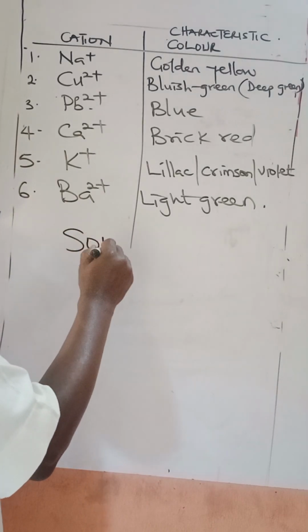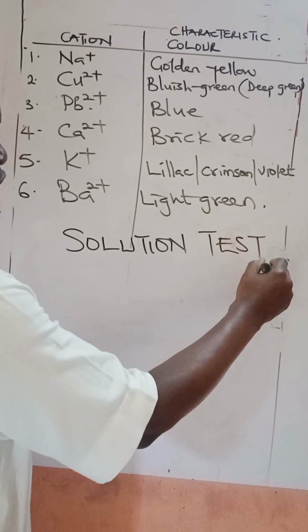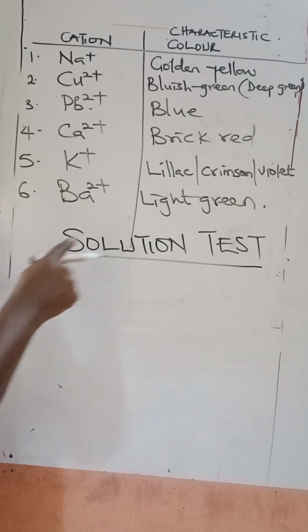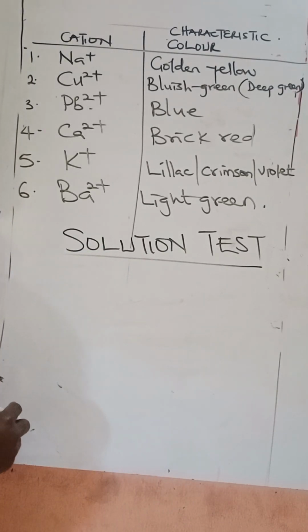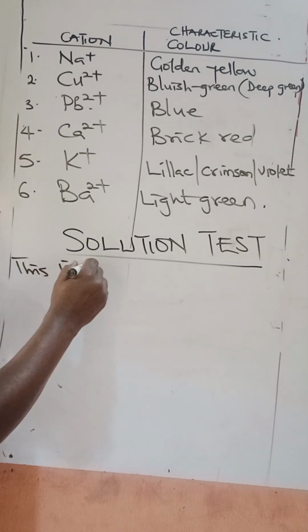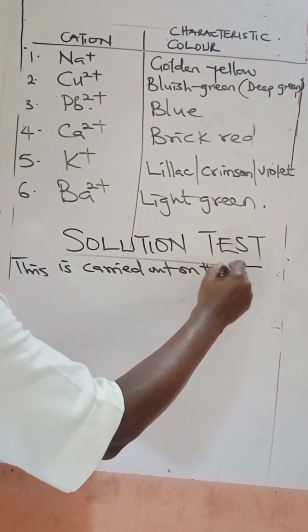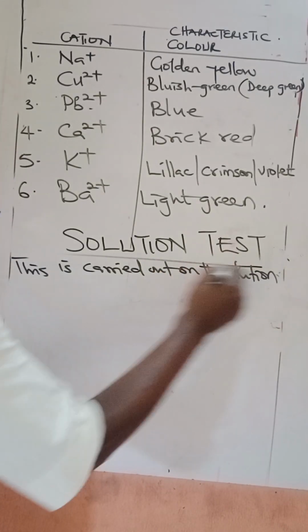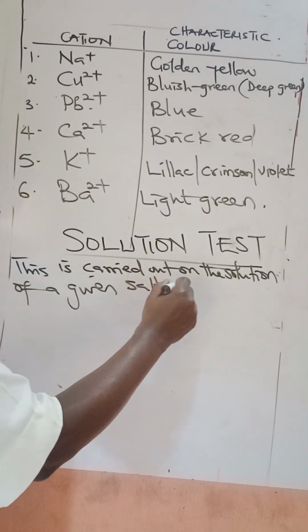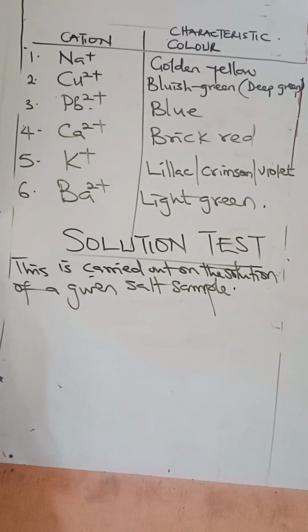The second one is what we call solution test. You can see that flame test is carried out on a solid salt sample, while solution test is carried out on the solution of a given salt sample. So we talk of solution here.